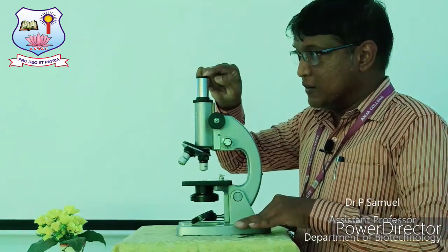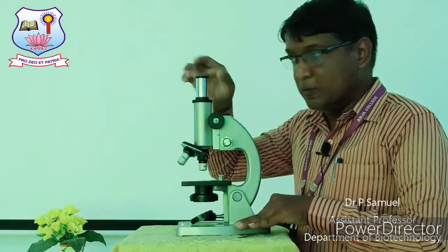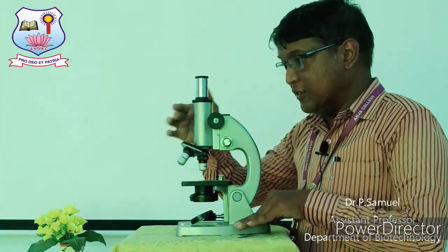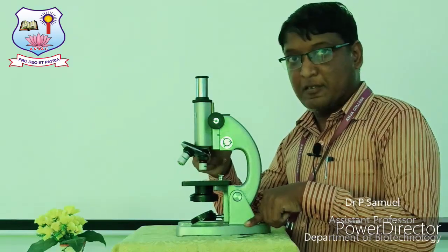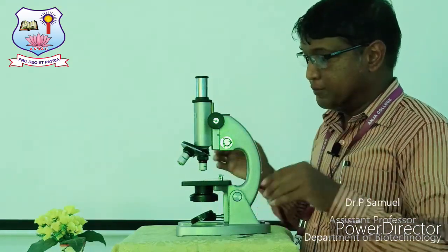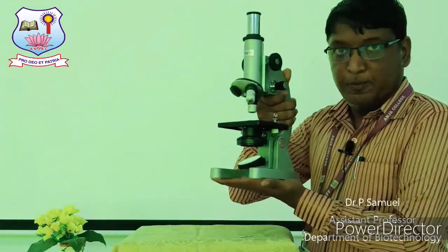Let's summarize. The one is called the eyepiece, which is constant, and the power of the eyepiece is 10x. This is the hollow tube. The other end of the hollow tube contains three lenses: low power, high power, and oil immersion. Right. And this is the way to handle a microscope.